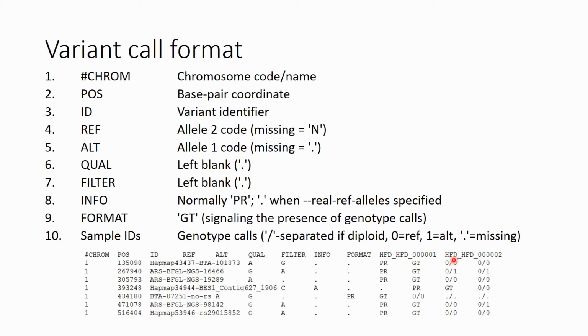So this would be for individual 1, individual 2, and then also the other individuals here, which indicate the genotype. Also, I want to mention that the VCF files are also very good not just for showing SNPs, but you can also indicate insertions and deletions and other variants in the VCF file. So in terms of scope, it has much larger possibilities.